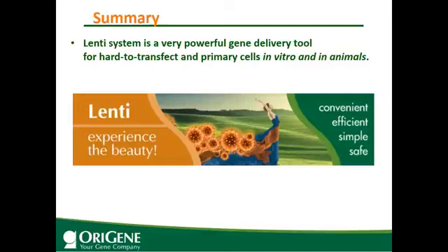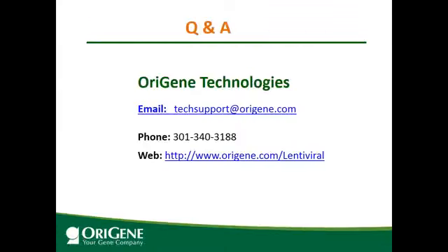So I have shown you the lenti system is a very powerful gene delivery tool for hard to transfect and primary cells in vitro and in animals. It is convenient, with a high transfection efficiency, and it's a simple protocol, and it's safe to use. So next, I will be happy to answer any questions.